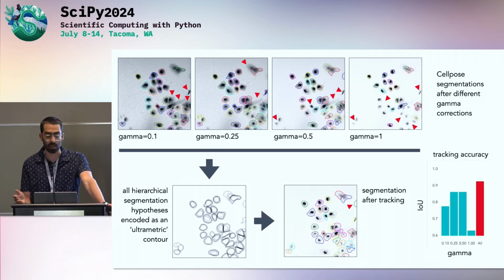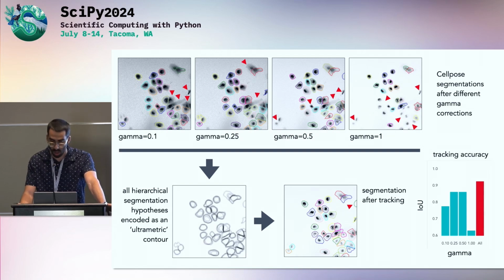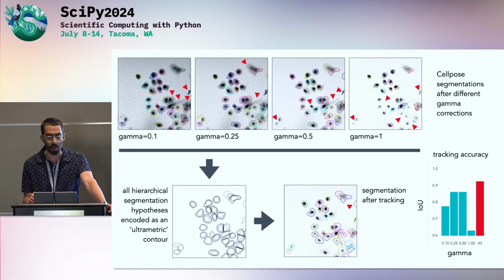Here we have the ground truth, so we can compute the metrics. Even if we could find the best parameter, our solution is still better than that one selected parameter. And in practice, very often you don't have the ground truth, so you won't be able to find this optimal parameter, and Ultrack would be useful anyway.